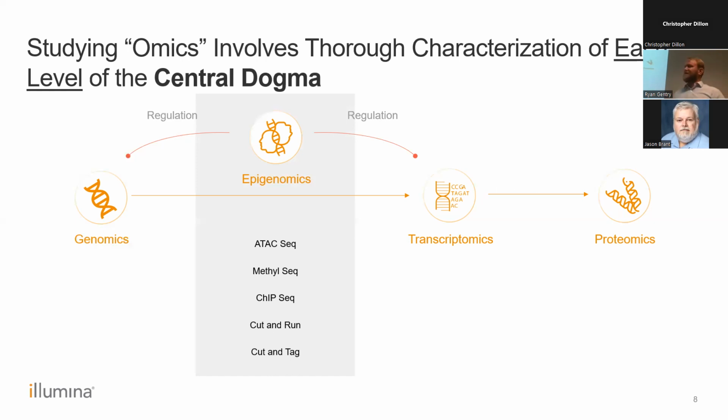And then ChIP-seq, CUT&Tag, and CUT&RUN are ways of looking at histone modifications. ChIP-seq is the main method, the oldest way of doing it. What you would do is chop up, sonicate your DNA, and add protein tags, and then we would use antibodies to pull those specific protein-bound DNAs out. We can do that with CUT&Tag and CUT&RUN. With CUT&Tag and CUT&RUN, specifically, you bind a single antibody to that protein. You'll bind a second antibody, and that second antibody is going to have the Tn5 transposase.